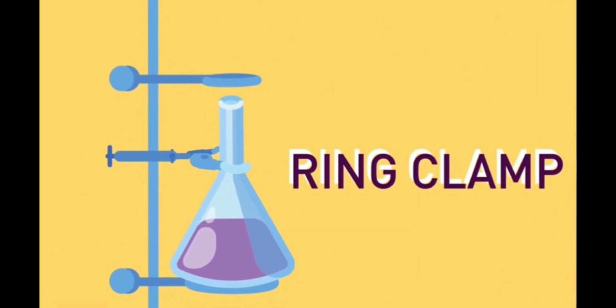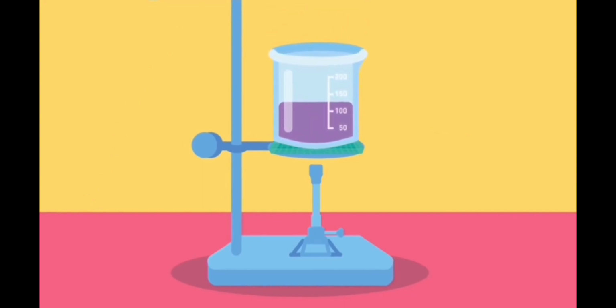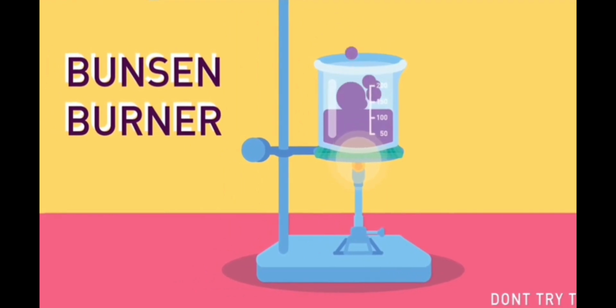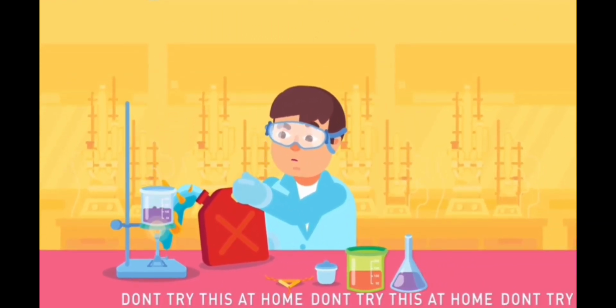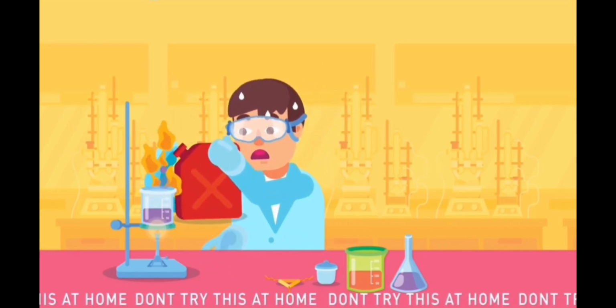Ring clamp, used with a ring stand to hold glassware such as a beaker or a funnel. Wire gauze, may have a fiberglass or ceramic center, used to support a container such as a beaker on a ring stand while it is being heated. Bunsen burner, be careful not to put flammable materials like a cloth or chemicals like aromatic compounds such as petrol anywhere near it, or this may erupt a fire.